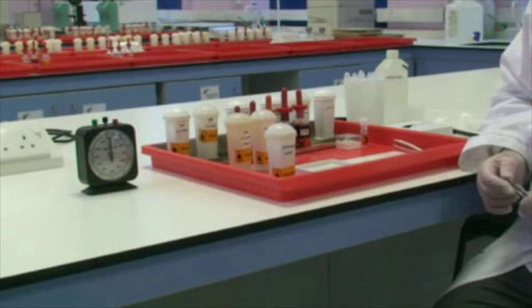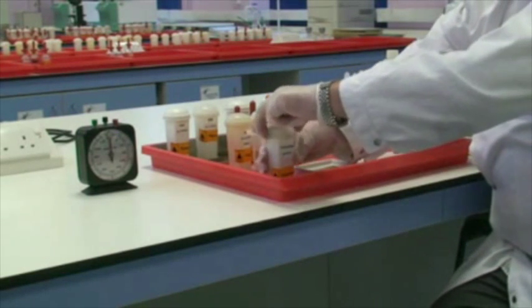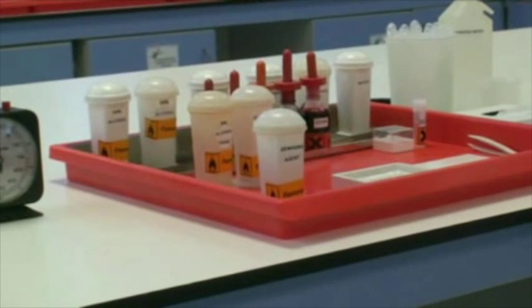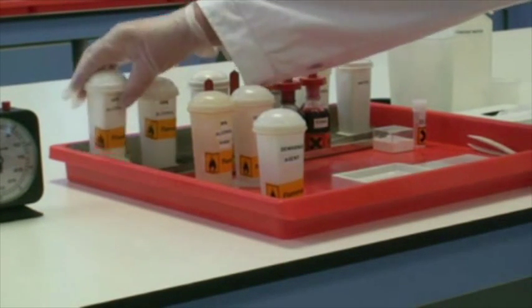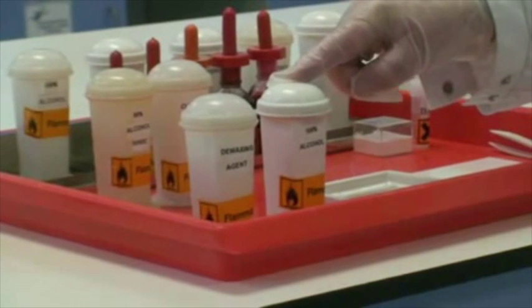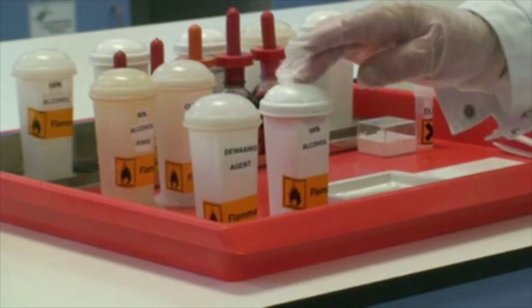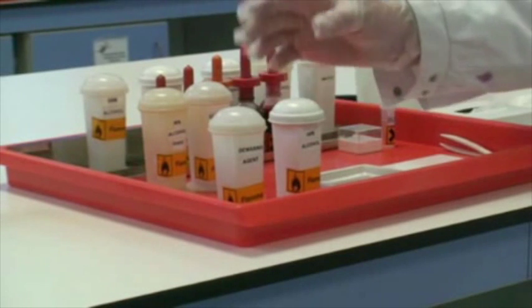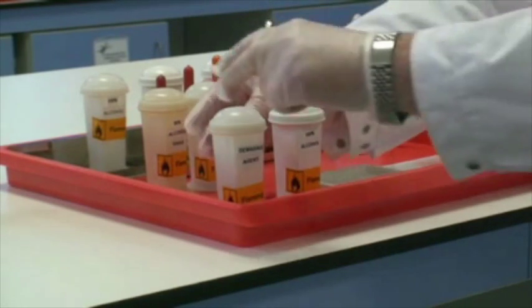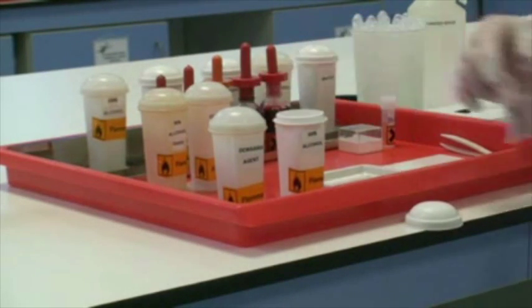The section has now been in the de-waxing agent, and all of the wax should have been removed. Our next step is to take it into the first step of the hydration stage. We're going to transfer the section into our first concentration of alcohol — it's 100% alcohol. I've brought this particular Coplin jar out onto the bench to load the section. I do not want you to ever leave your slides in the Coplin jars out on the bench.